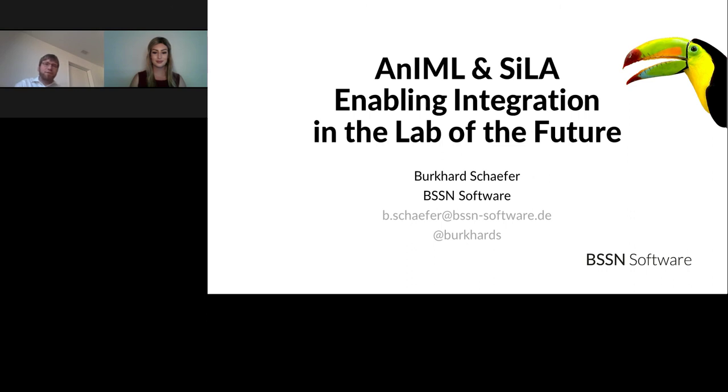Because if you open up and you provide tools that are open, well, let's say you're selling mass spec software. Suddenly your software will be able to work with data from a different vendor as well. So your market opens up. Or if you're a LIMS company such as Labware and you are in the business of ingesting data, then obviously reducing the number of interfaces that you need to support is a direct impact on the bottom line.